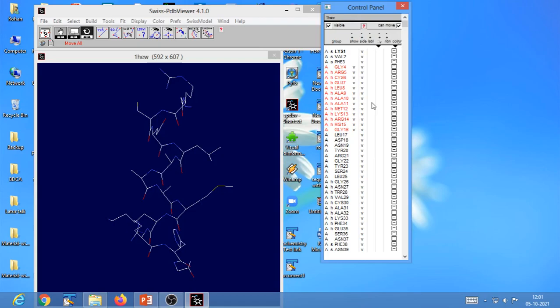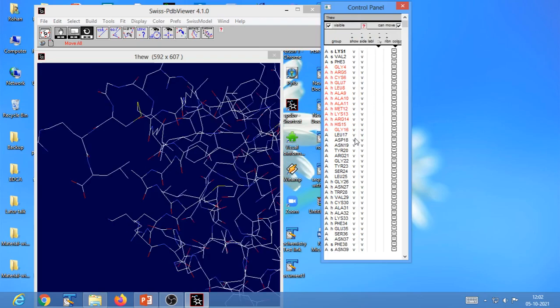On the other hand, when you shift click in empty space, Deep View would place check marks in that column beside all the groups and take appropriate action. Let us try this out by shift clicking several times in the show column. Here is the show column. Shift click.